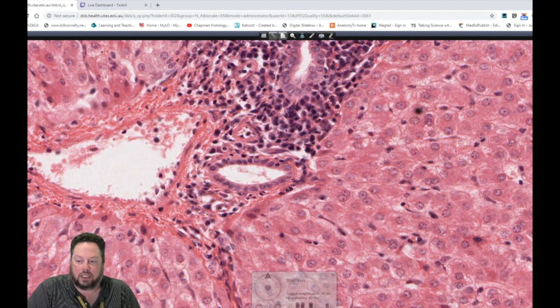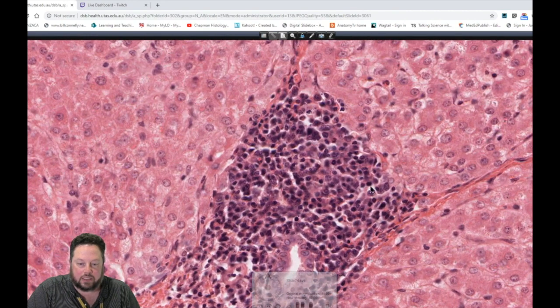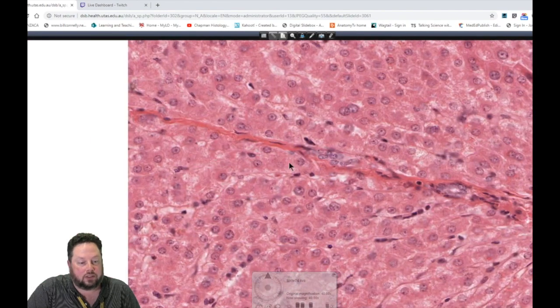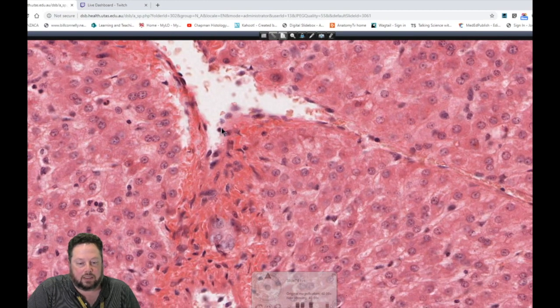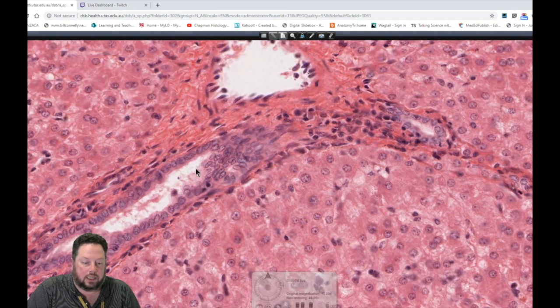That's just beginning our interpretation of these regions here. Again, lots and lots of white blood cells here. Here we've got the bile duct. If you scan along, we can actually see these different things. Again, we've got the vein here. Here's the bile duct. Again, we've got the vein. Nice bile duct here. You can see, it looks a little bit like a guitar.